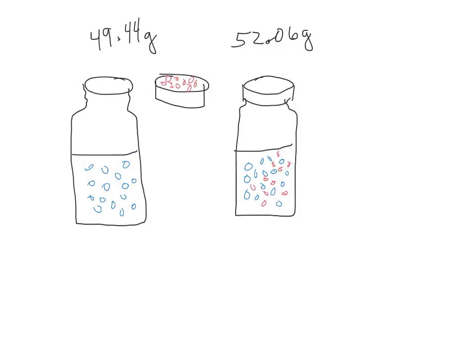You all, whoever you are, and you know who you are, you groups, you never measured that. If you went up by about 2.5 grams or so from the before to the after, the cap itself has a mass of 1.7 grams.